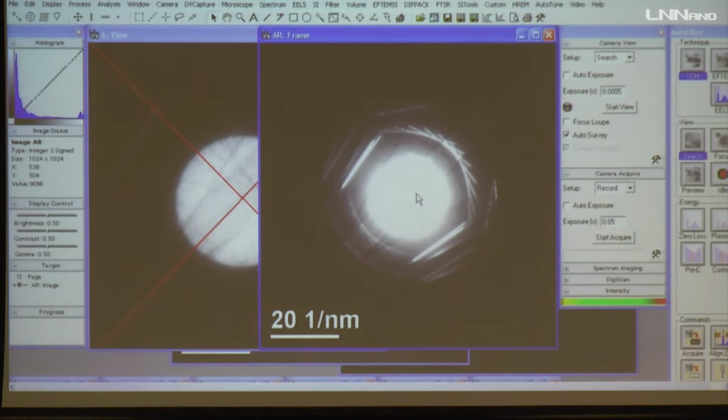If you use a lower spot size, say 1 nanometer or 0.5 nanometer, the intensity will be much reduced. During that time, you can use higher exposure and get very good details here. Those details are useful if you are working on an unknown crystal. Say you are working on a new crystal and you haven't done any XRD on that. If you want to understand what the lattice type is, you need to have these details, and based on that, you can say what the lattice type is.